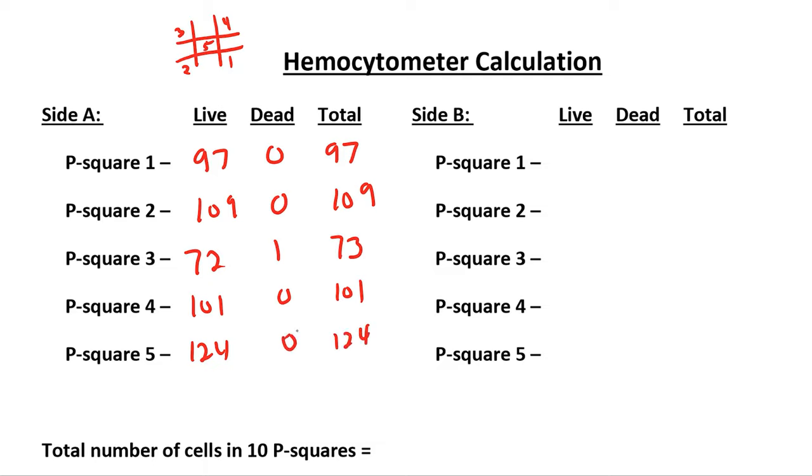This is very common to not have many or any dead cells on the hemocytometer. We moved to the other side, we counted five P-squares, 103 live, one dead, 104, 90 live, zero dead, 90 total, 82 live, one dead, 83 total, 77, 0, 77, and 56 live, one dead, give me a total of 57 cells.